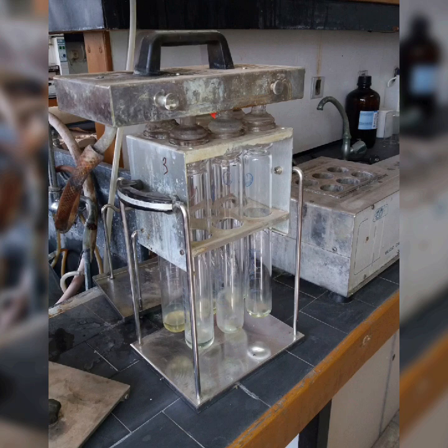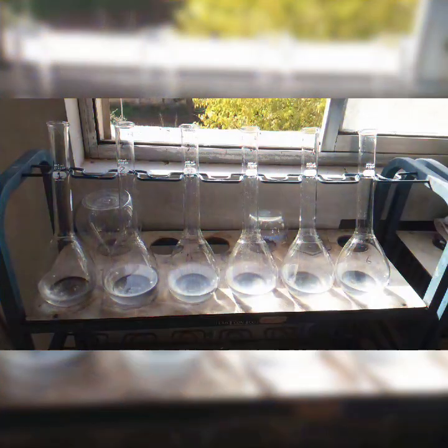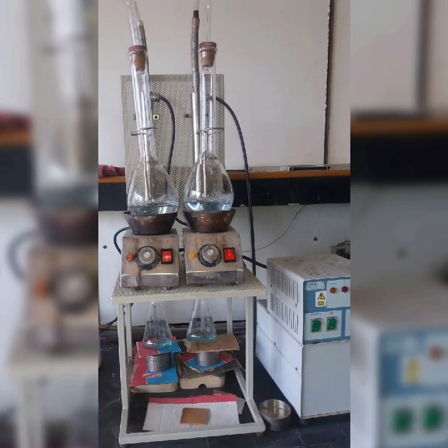Here's where things get interesting. We need to separate the ammonia from the digestion soup. How? By adding sodium hydroxide, or NaOH, a strong base, to neutralize leftover acid and convert ammonium ions into ammonia gas. Now, you might ask, why make ammonia a gas? Because gases are easier to collect and measure. It's like letting steam escape from a kettle and catching it in another pot. This escaping ammonia gas is captured in a precise amount of hydrochloric acid, a process known as absorption. The technical term here is quantitative transfer, which just means we're collecting as much ammonia as possible.